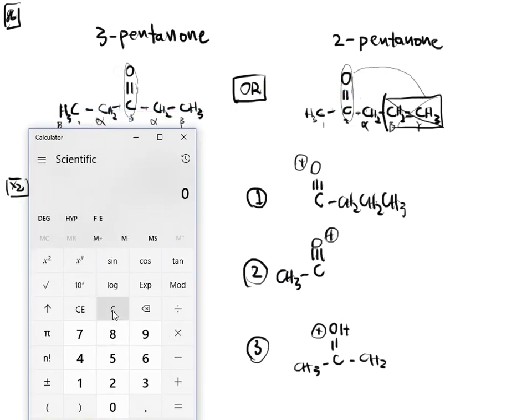Now keep in mind, this molecule can break up in a number of different pieces. I'm not saying that that CH3 group at the end cannot come off. It can. But according to the rules that we've talked about, they have a tendency to do certain fragments. We are doing the tendency of those fragments. We're not listing every single thing that can happen. We're just listing some of the major things that will go on. But that molecule can fragment in more than just the 57. But if I'm looking at it, and if it has a preference, then that's what it's going to show me.